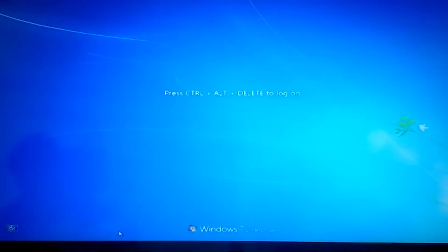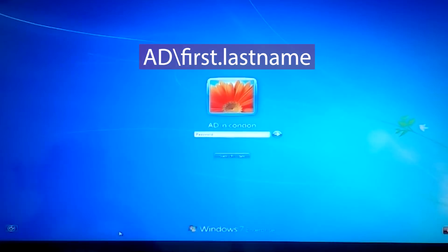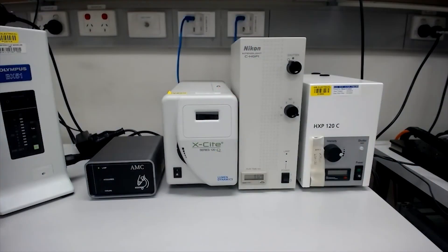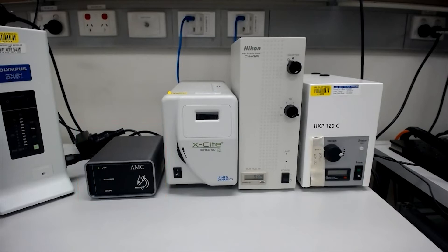On the wide field systems, the computers are generally left on. Log on to the computer using your IMB-AD credentials. On every wide field system, there's an automatic microscope controller unit, an AMC unit, to power the microscope and the lamp. The AMC controls the length of time the microscope and the epifluorescent lamp are on to extend the life of the bulbs and the equipment.